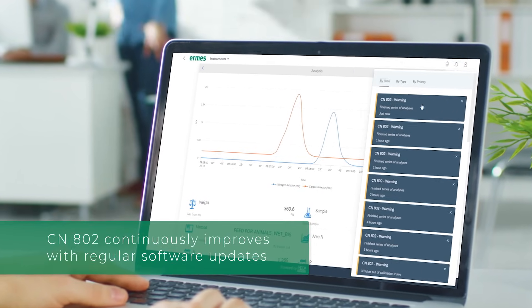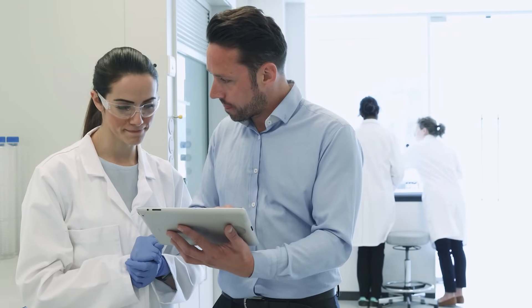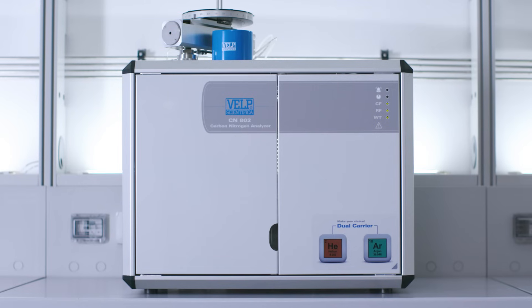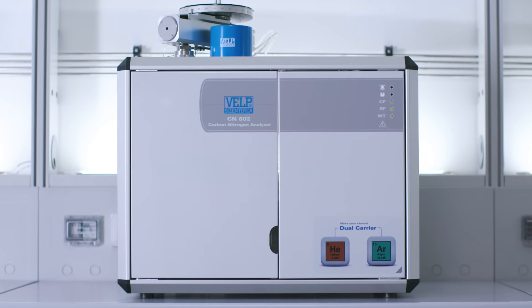Thanks to regular software updates, introducing new features, functionality, and enhancing performance. VELP Scientifica CN802 is the elemental analyzer designed just for you.